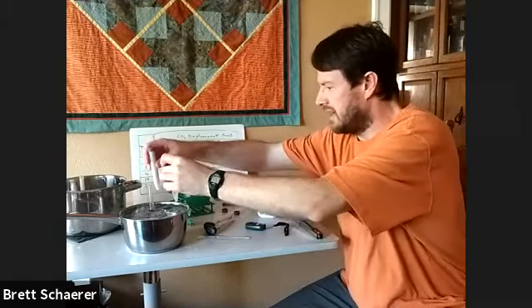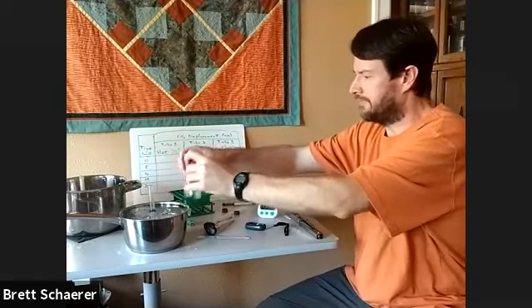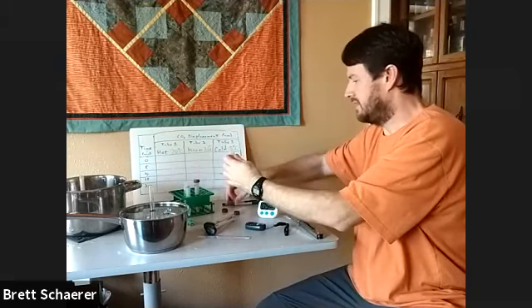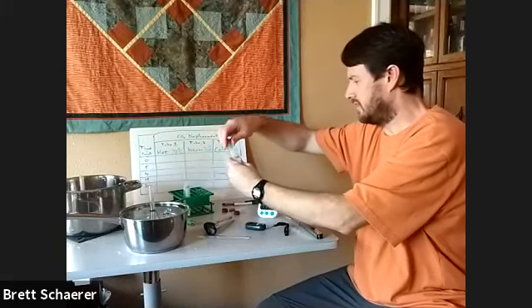And we'll do the warm environment the same way. And mix the yeast and glucose.